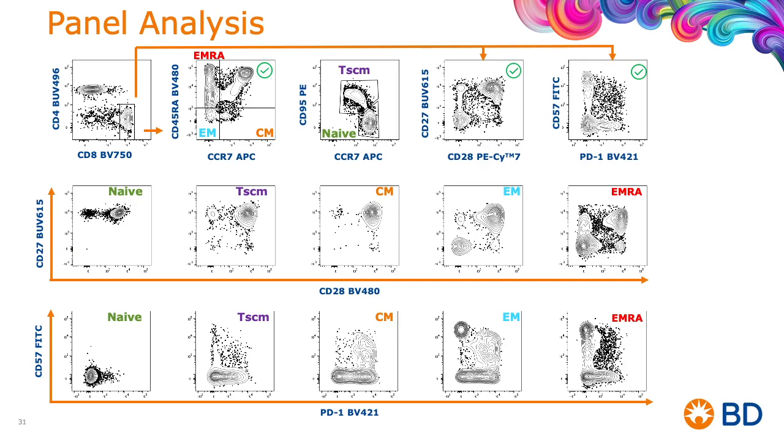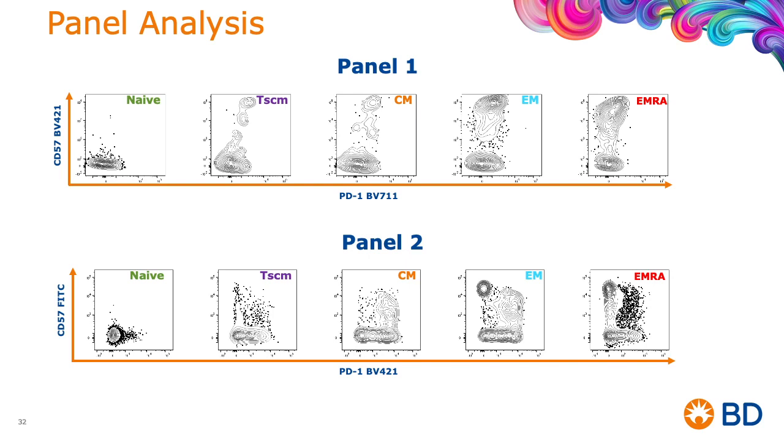And just to emphasize again how the better selection of fluorochromes from the same exact instrument can have a significant impact on your biology, we're going to compare side by side. On the top was the first panel where we didn't pay attention to spillover and spread. And the bottom is the panel where we strategically selected upfront fluorochromes with very minimal spillover to simplify the process, and most importantly, not run into mistakes or problems that would have impacted biology. So you can really see the stark contrast between the two.